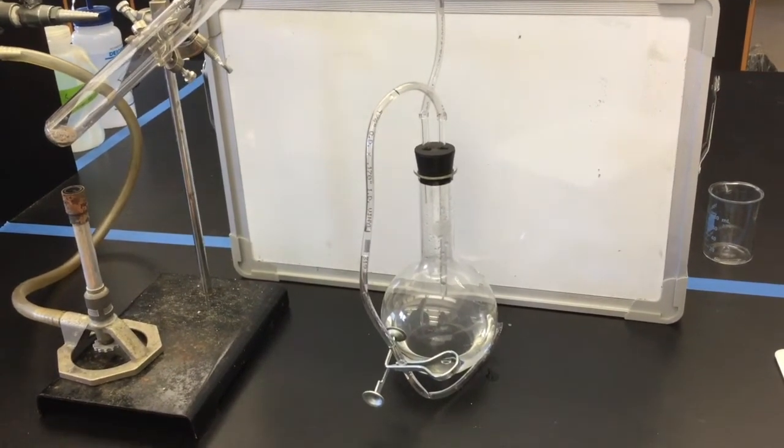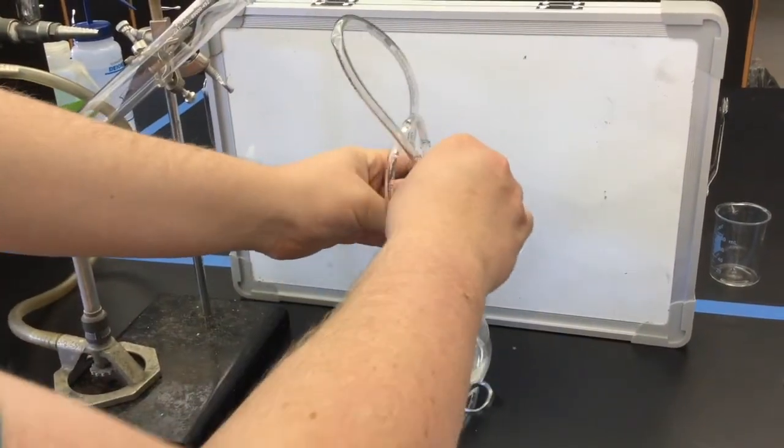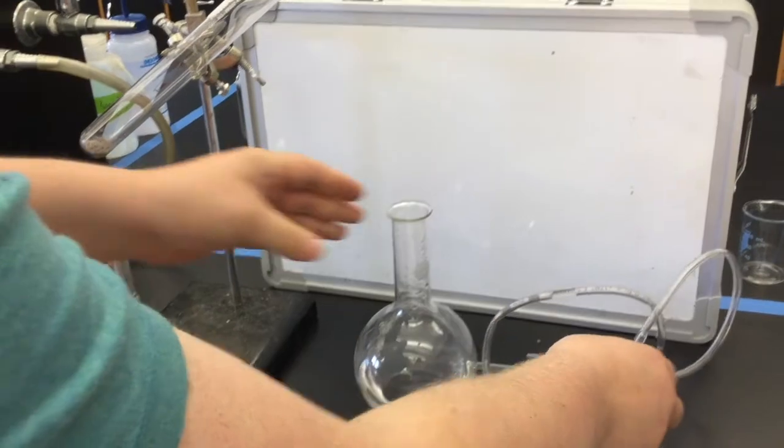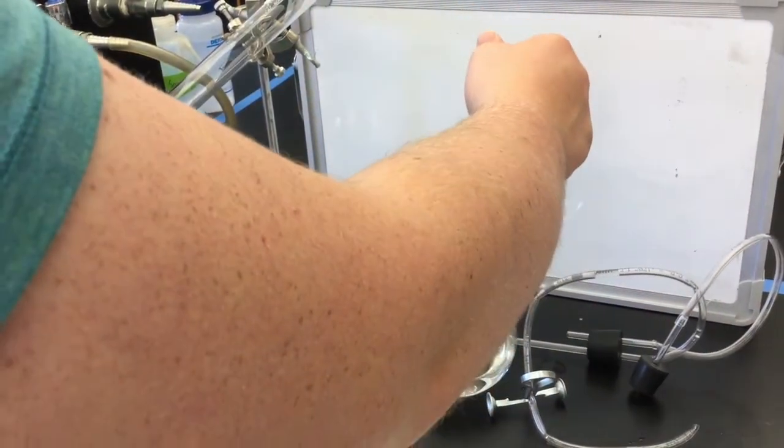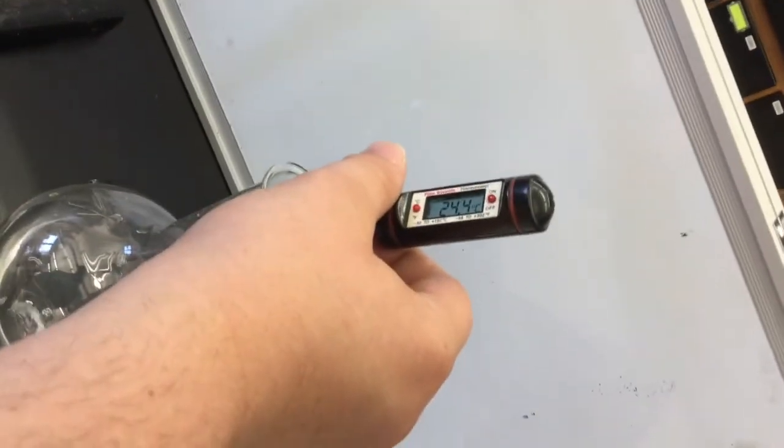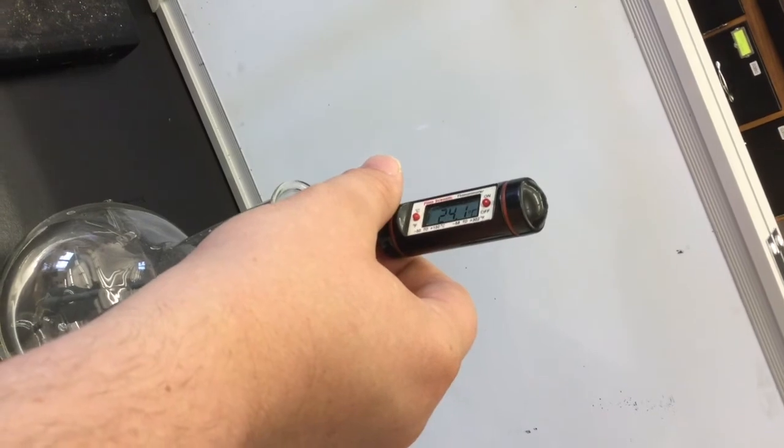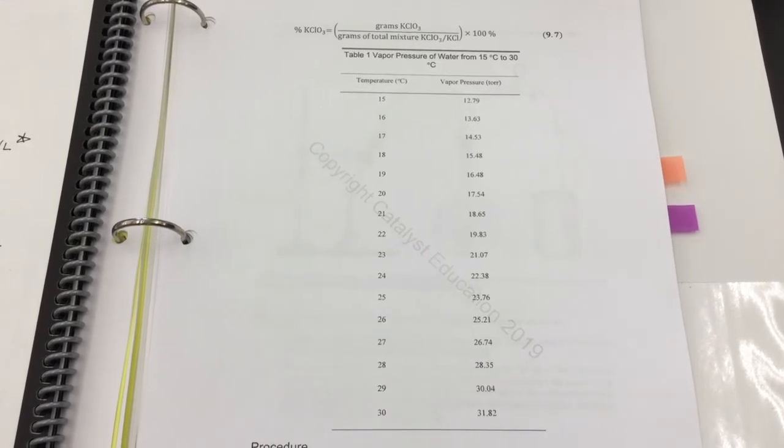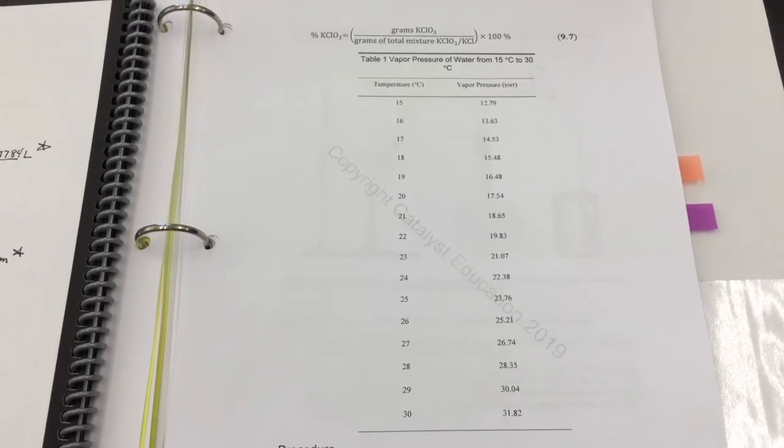Remove the tubing from the flask and the test tube, and use a thermometer to record the temperature of the remaining water in the flask. Remember to allow the thermometer to sit for 30 to 45 seconds so that the temperature can stop changing and equilibrate with the water. Use the table in your lab manual, along with the temperature you just recorded, to determine the vapor pressure of the water in the gas that was produced.